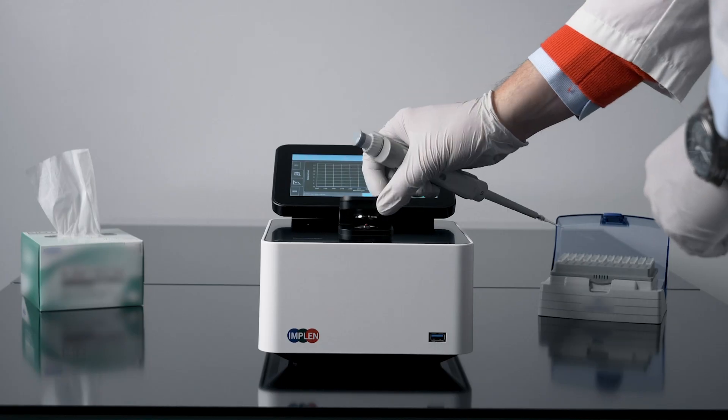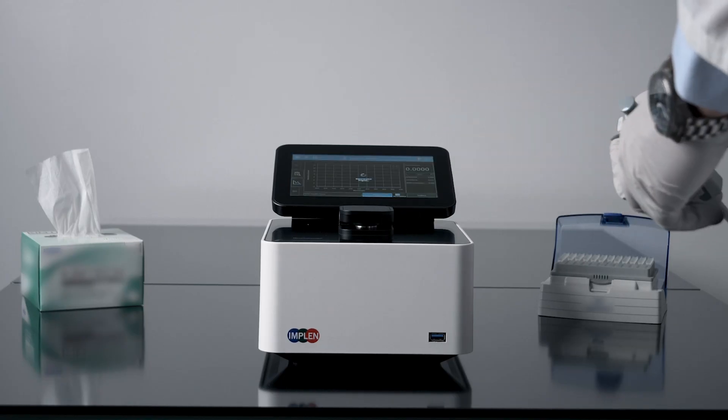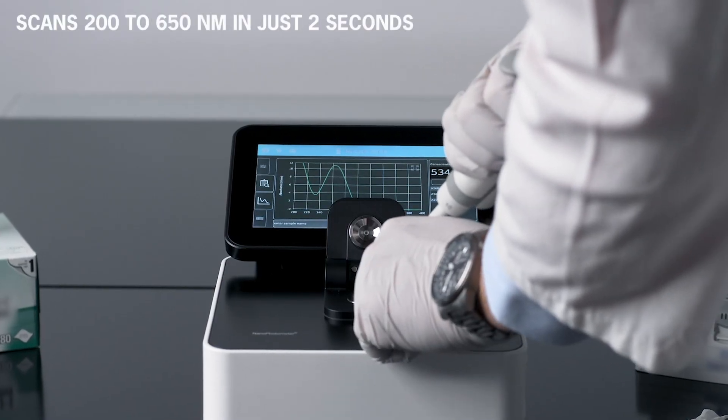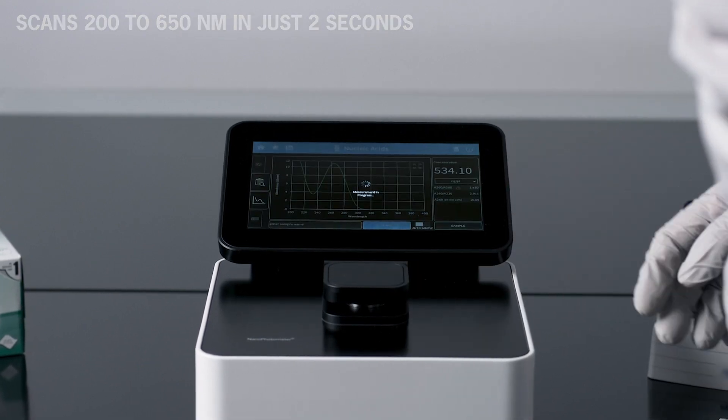This spectrophotometer scans samples. It analyzes nucleic acids and proteins, scanning from 200 to 650 nanometers in just 2 seconds.